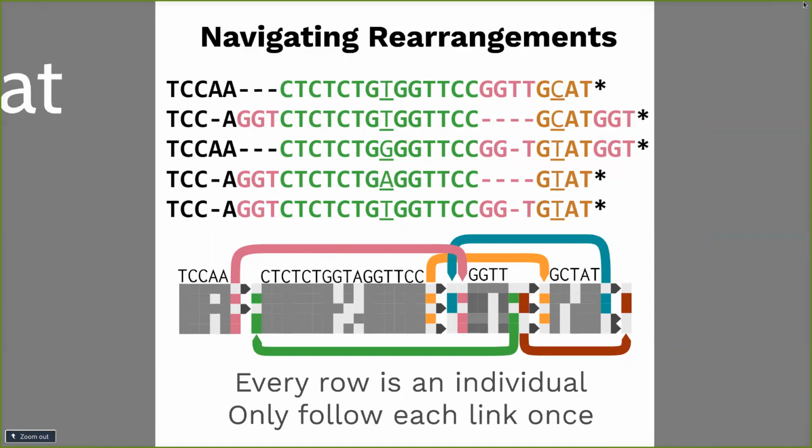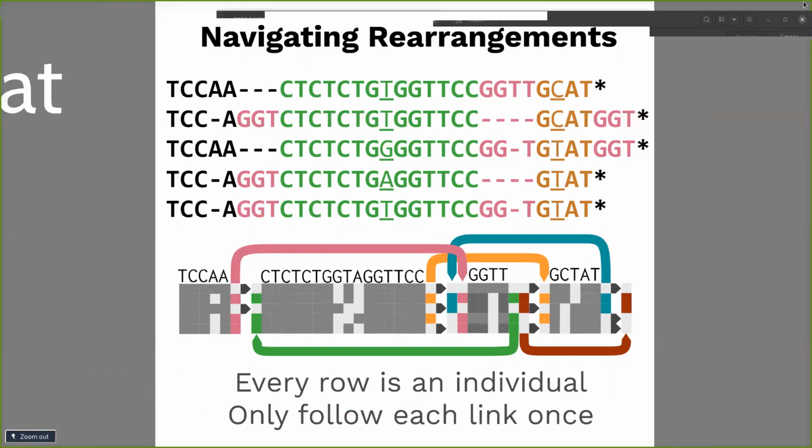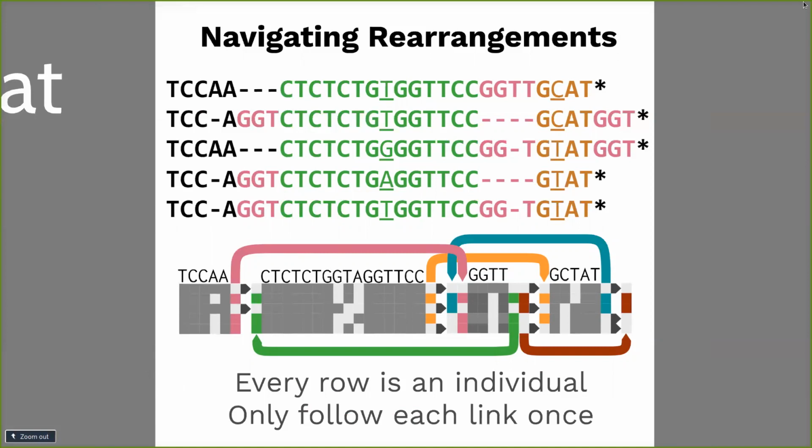In the figure are reported 5 sequences in a multiple sequence alignment on the top, and a Pantograph representation of the same sequences on the bottom. Matching sequences are colored to show you the arrangements not shown in a multiple sequence alignment. We use colored lines called links to show structural variations present in the pangenome. The links join different components in different ways for each individual, showing the order of matrix components to follow for reading each sequence.